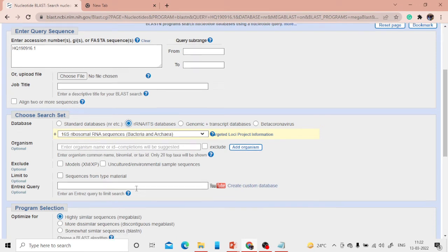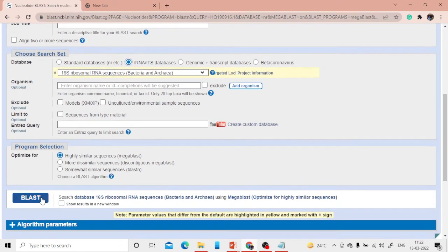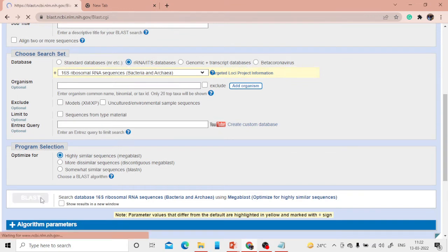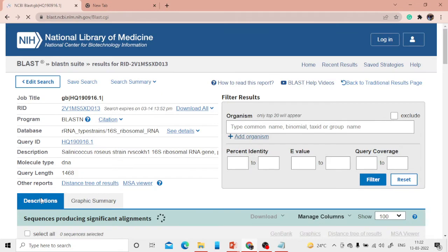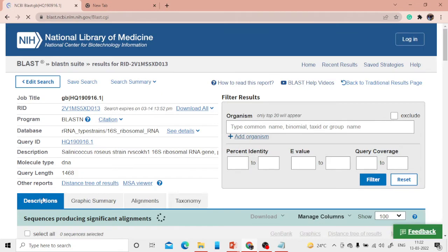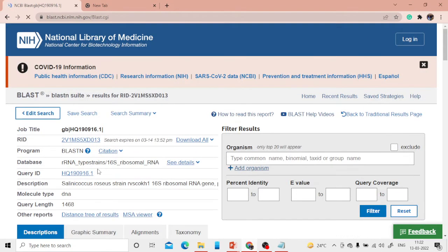Let me now simply perform the BLAST search. Depending on internet speed and server load, results will come within one or two minutes. You can see BLAST results quickly appeared.